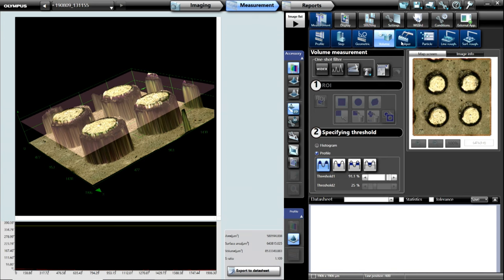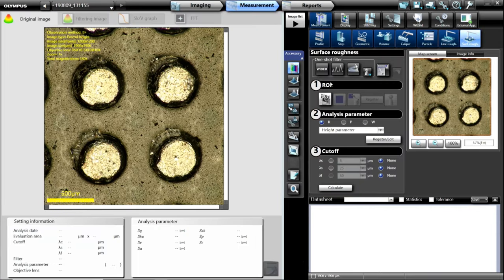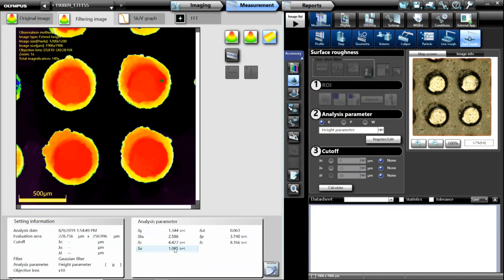Additional features in the software include caliper measurements where it does edge detection and measures distances between lines or circles. We can do particulate analysis. And another great feature is surface roughness measurements and line roughness measurements. Since we have all that Z height information, we can specify a region of area on the surface of a pin, mark a little area, and calculate the surface roughness — it reads out about 1.08 microns of surface roughness. You could mark multiple regions and get all the roughness information individually for each pin.